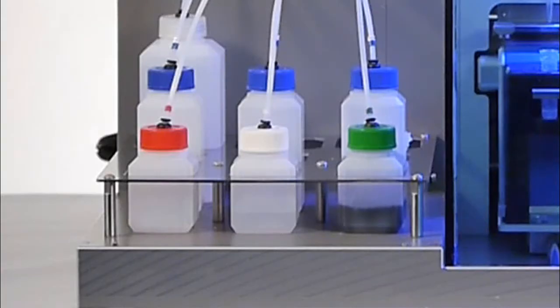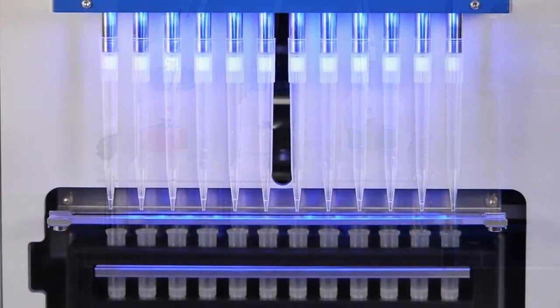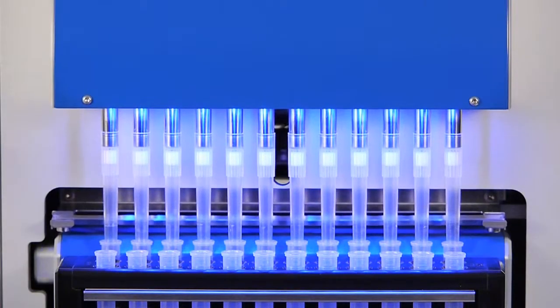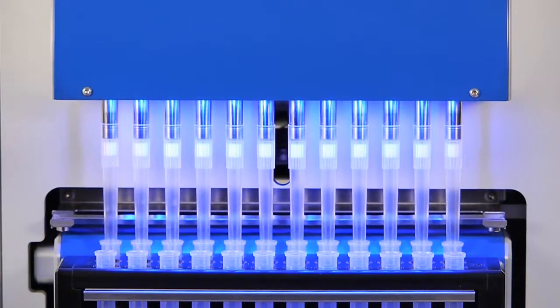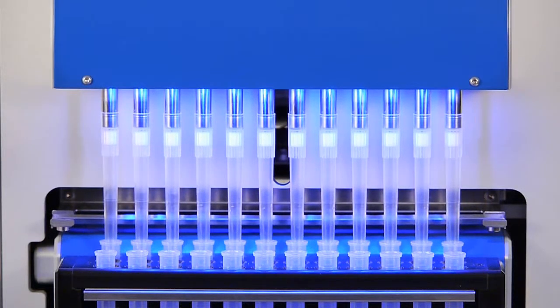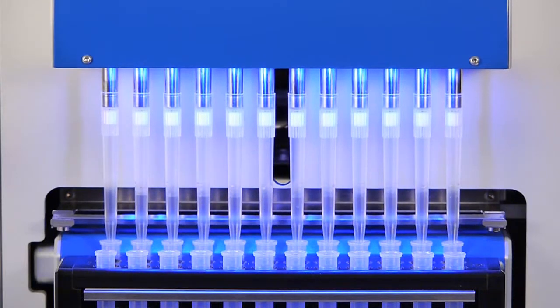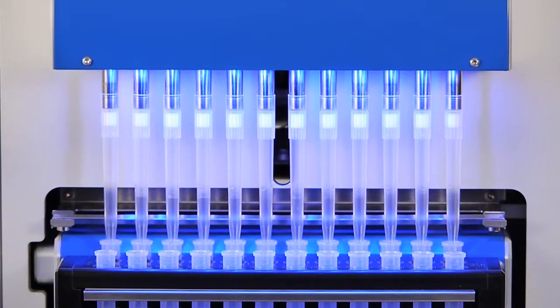In the next step, binding buffer is added to the reaction tubes. This buffer contains magnetic beads, which cause its black color, and gives the Foodproof Magnetic Preparation Kit 1 its name. Using this magnetic bead technology results in high-quality purified DNA. As shown here, the solution containing sample and buffer is mixed by pipetting up and down. During this mixing step, the isolated DNA binds to the magnetic beads.